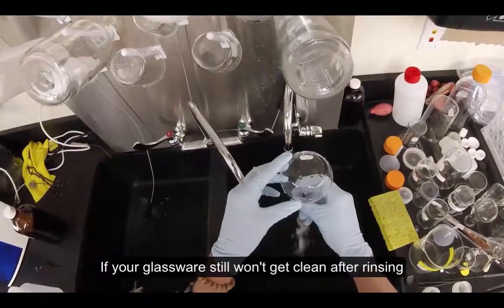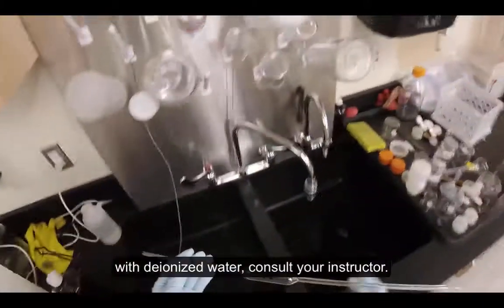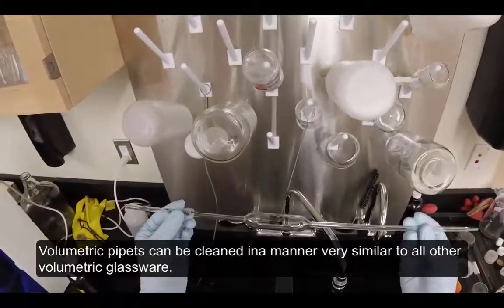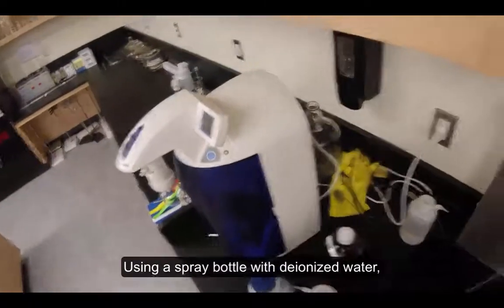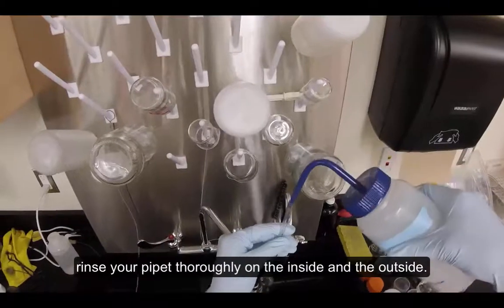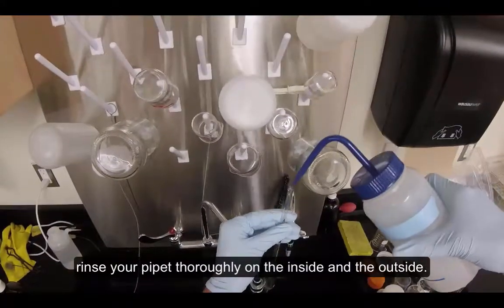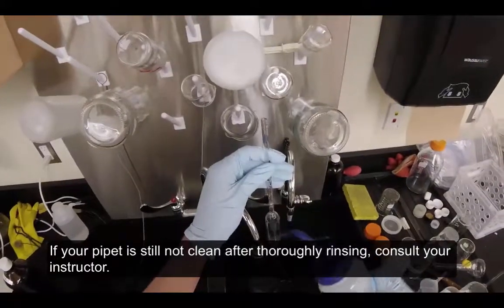If your glassware still won't get clean after rinsing with deionized water, consult your instructor. Volumetric pipettes can be cleaned in a manner very similar to all other volumetric glassware. Using a spray bottle with deionized water, rinse your pipette thoroughly on the inside and the outside. If your pipette is still not clean after thoroughly rinsing, consult your instructor.